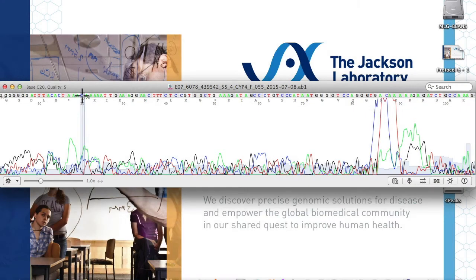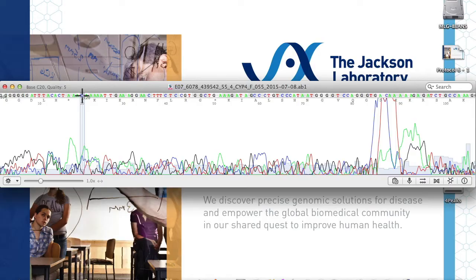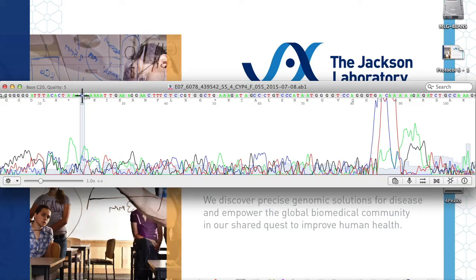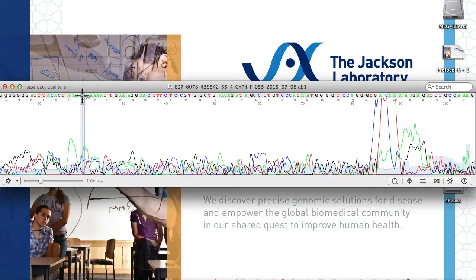So what is good quality and what is poor quality? Good quality sequence reads have distinct, steep, and smooth single-line peaks representing well-separated fragments as they pass by the fluorescence detector in the sequencing machine. If peaks overlap, are jagged, or contain broad shoulders, then the software-based calls are no longer reliable.